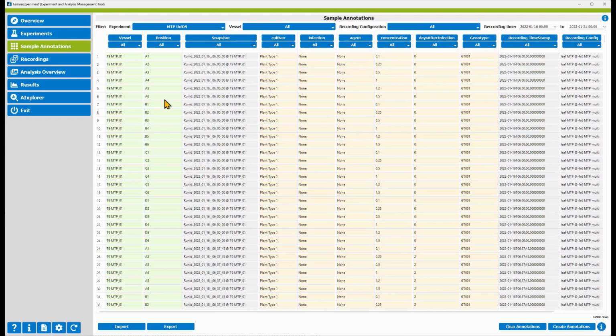If you want to edit a value, you have to double-click its cell. Now you can enter values here. You see a completion list from which you may choose, or you enter a completely new value. If we do this on a column with predefined values, these values are listed in the completion list. You are not allowed to enter other values.